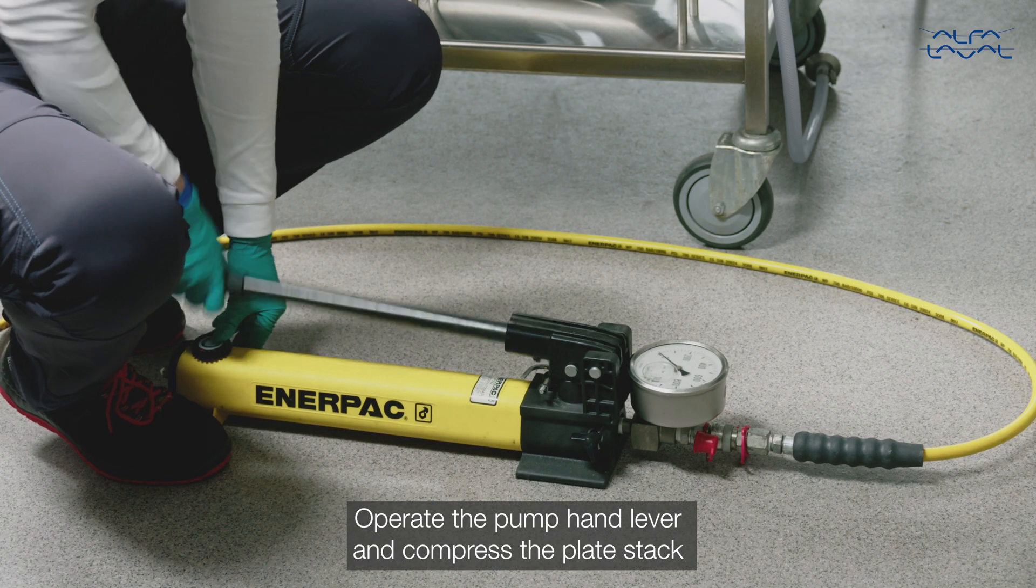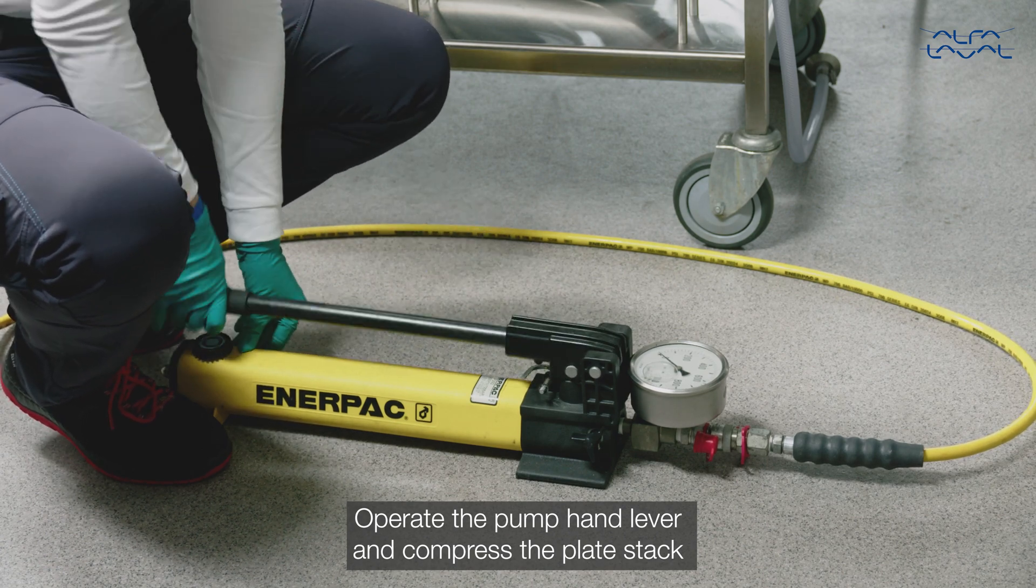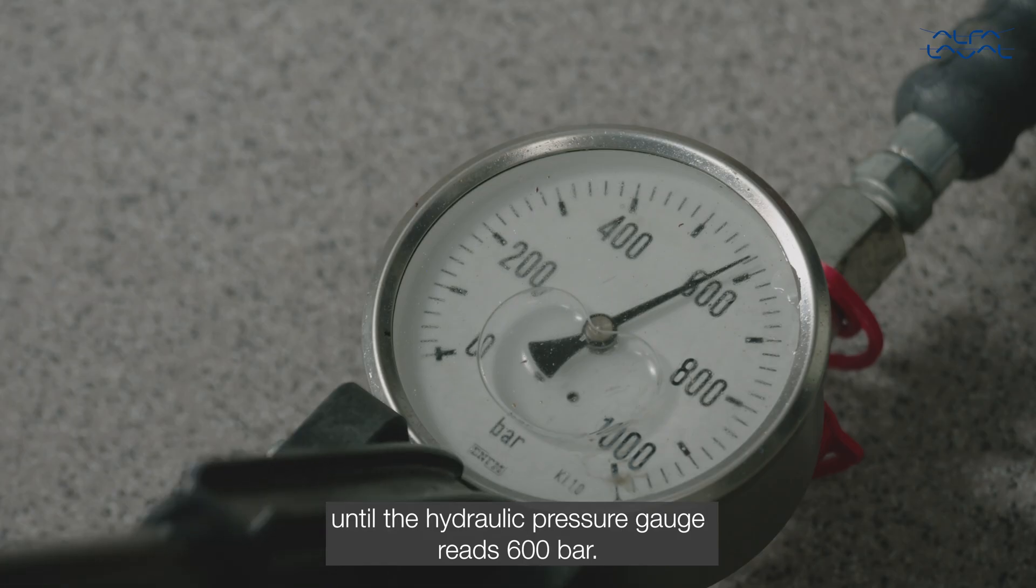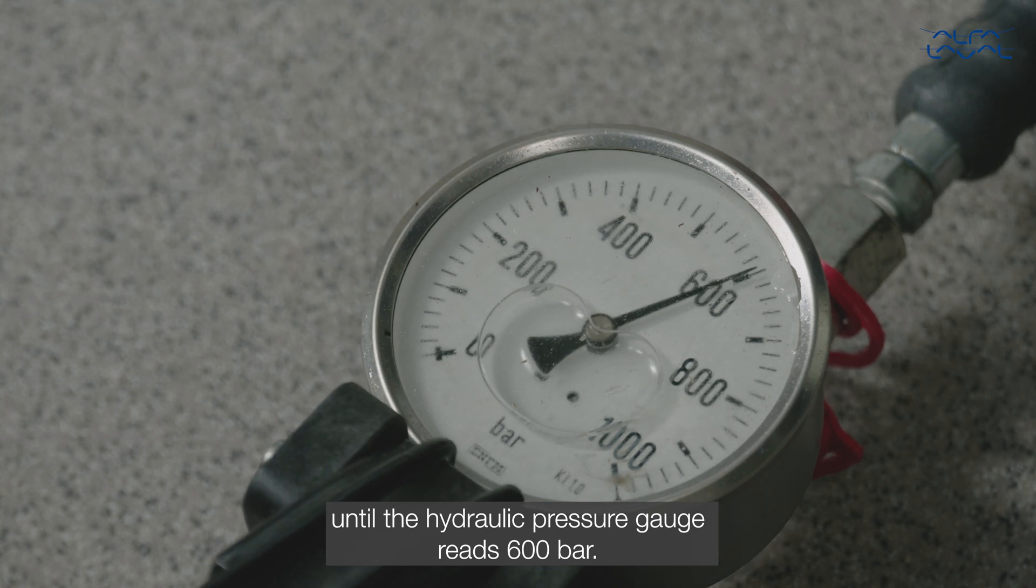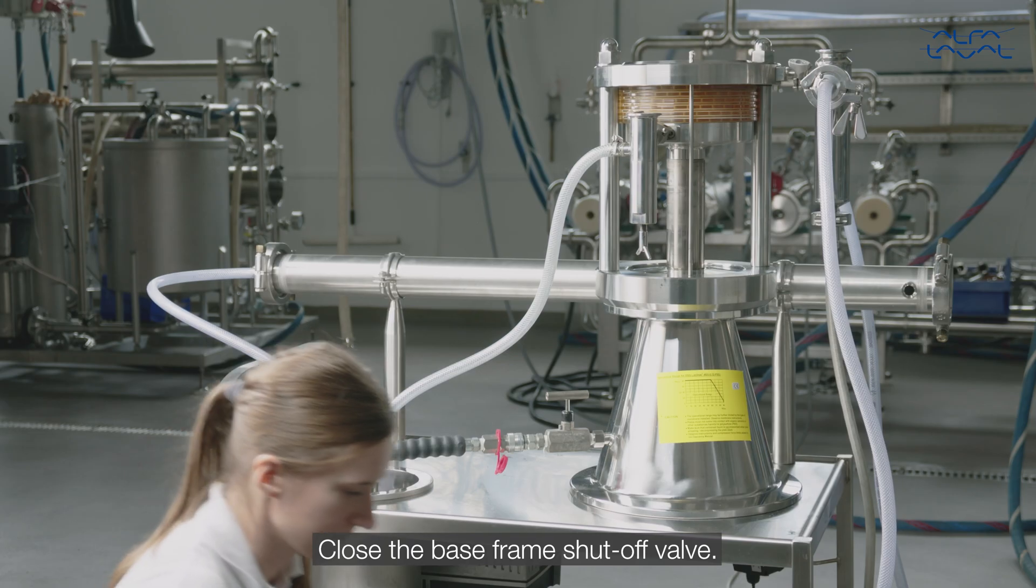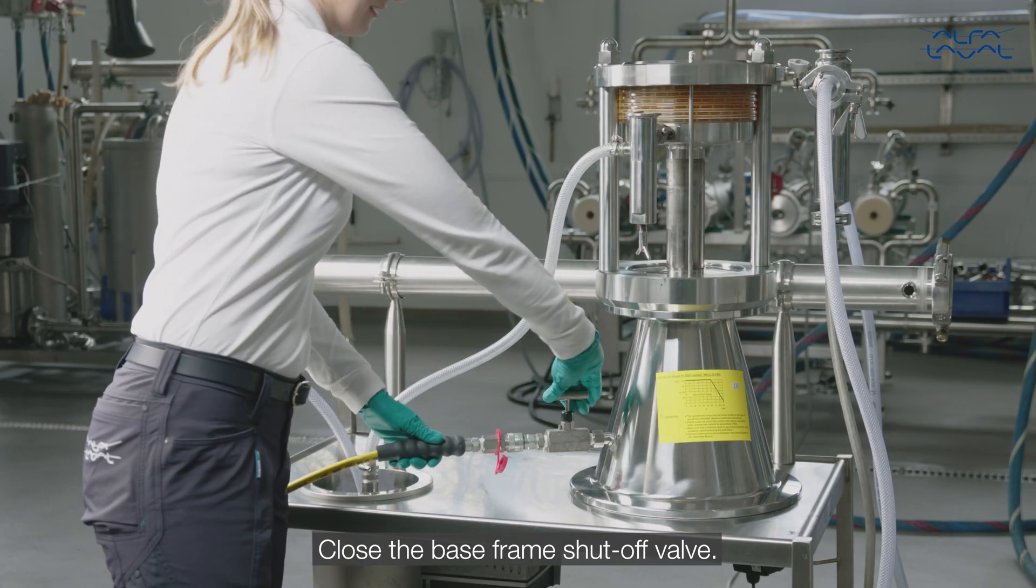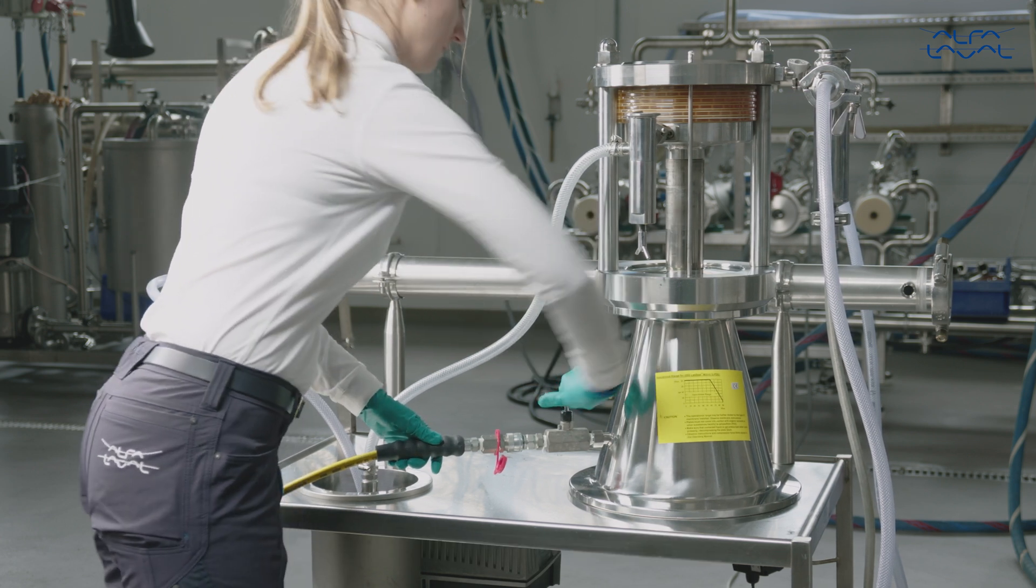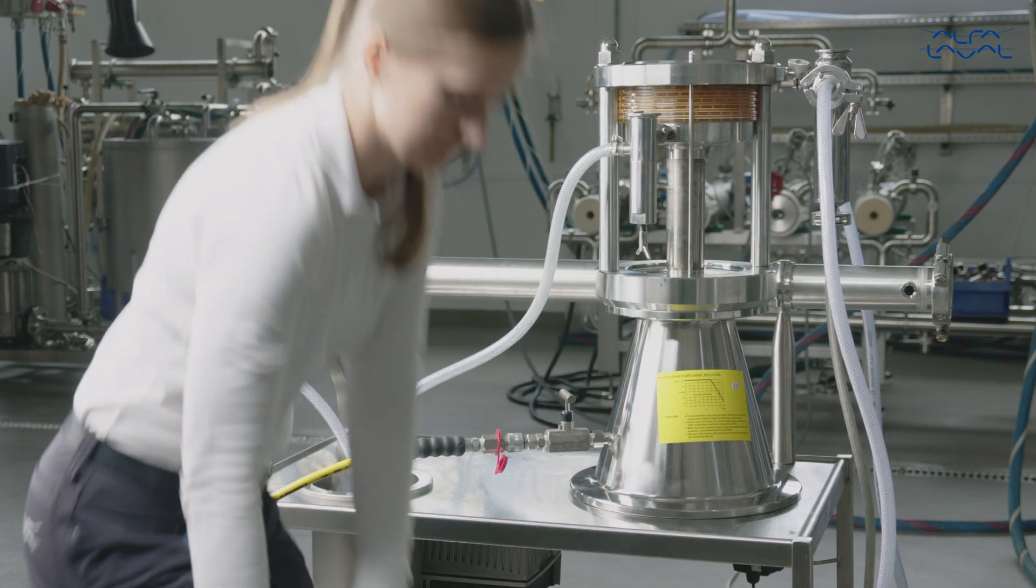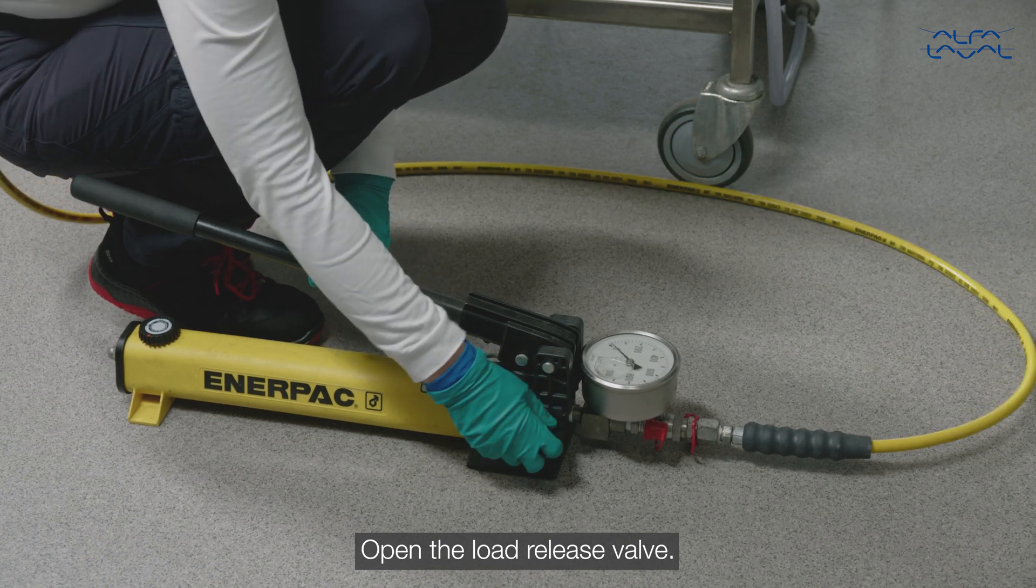Operate the pump hand lever and compress the plate stack until the hydraulic pressure gauge reads 600 bar. Close the base frame shutoff valve. Open the load release valve.